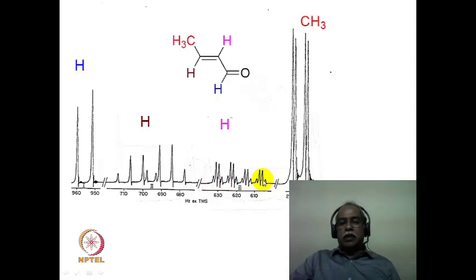You can actually see two sets of quartets, one set here, another set here. So the four quartets are essentially seen as a doublet of a doublet, which will give 4 lines, and the 4 lines are further split into a quartet by the CH3 functional group. So this is essentially the spectral feature of the magenta hydrogen in terms of its multiplicity pattern.